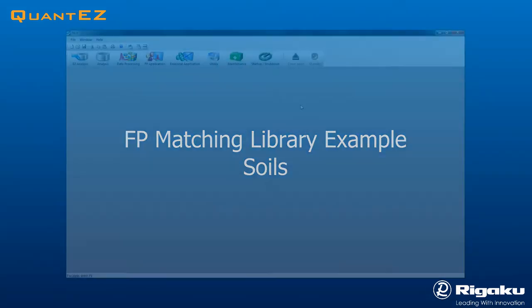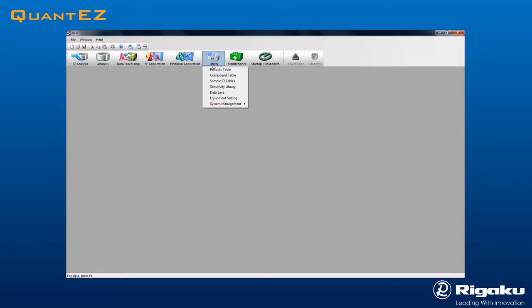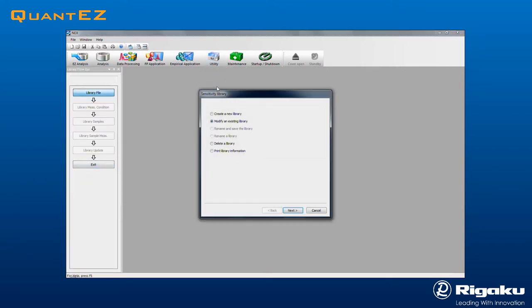A matching library is used in conjunction with fundamental parameters to greatly improve analytical results for a specific application. Click the Utility icon and select Sensitivity Library from the drop-down menu. This example will examine modifying an existing soil matching library. Note that the flow bar appears to guide every step of the process.